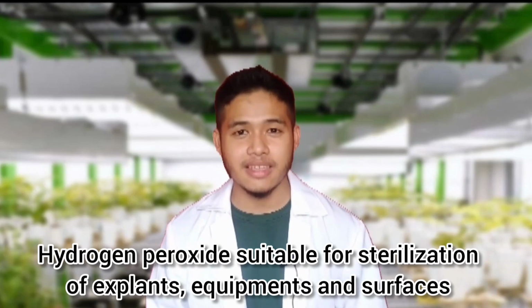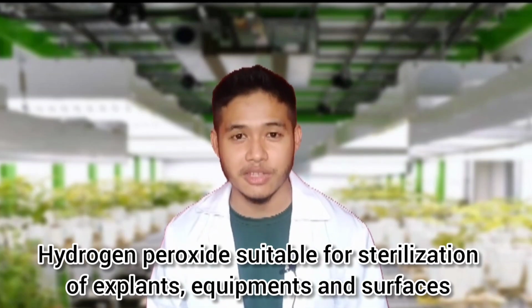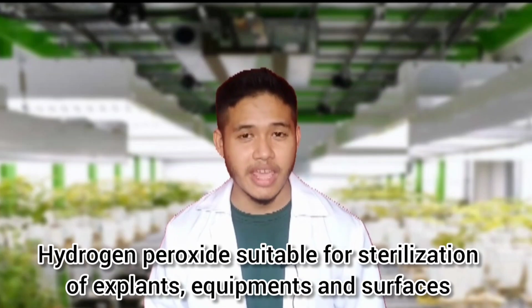Overall, hydrogen peroxide is an excellent chemical for sterilizing explants, equipment, and surfaces in any lab, as it has few side effects compared to the other two.